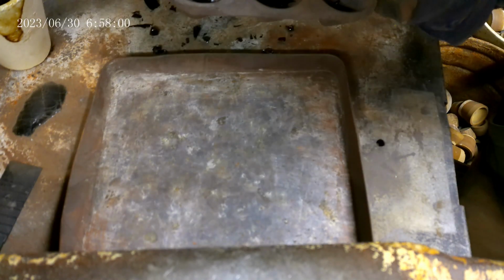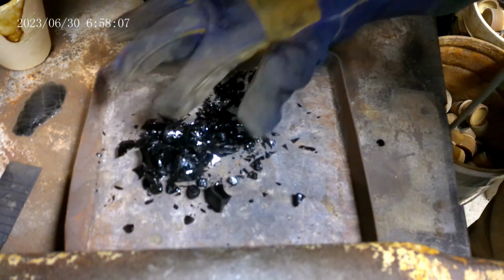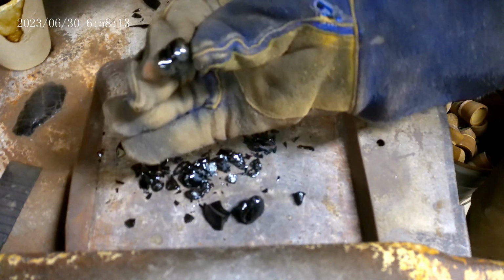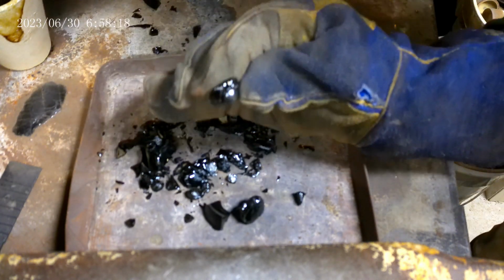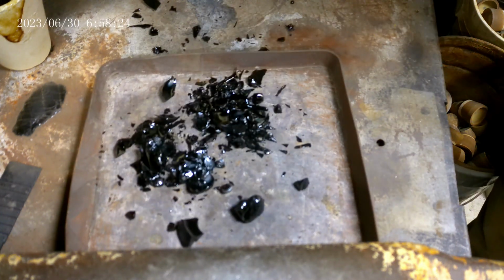Okay, let's take a look at this slag, see how it turned out. It's pretty good. Here's the button. Oh crap, look at that teeny little button. Needed way more flour in that. That's unfortunate. I may re-smelt that. I'm going to keep that slag.